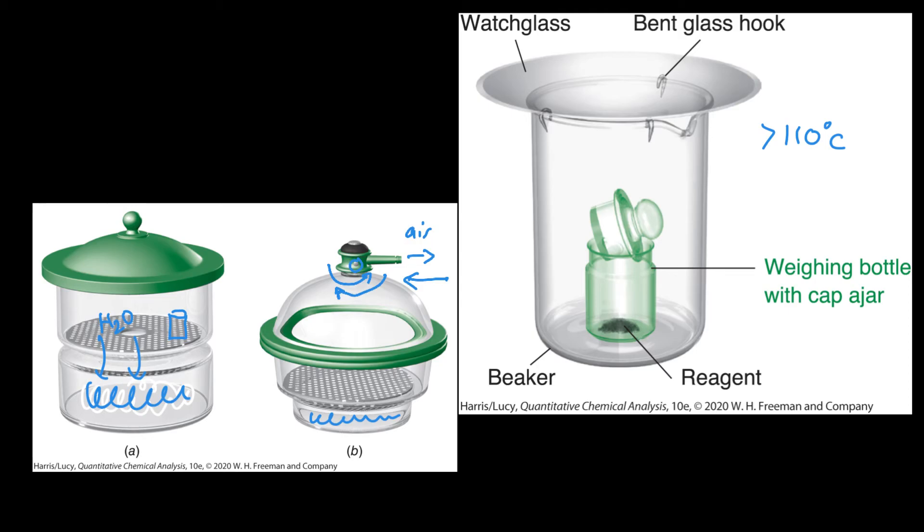We have to be a little careful as the air rushes in, as it can disturb the surface of our sample. We normally want to make sure our sample is covered up with a watch glass, or in the case of a weighing bottle, we just put the lid on slightly ajar.